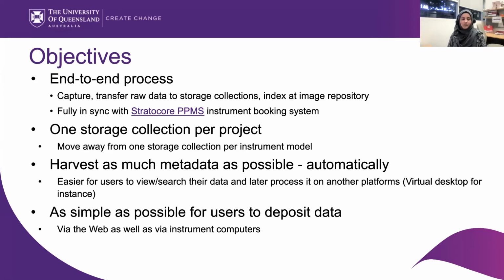So we dealt with it in two ways. In Pitschi, we are also using a web version of Clowder, so they can just upload using the web browser, and we mount the collection directly to the instruments project-wise, and they can just land their data in there. So these are the main objectives we took care of when we were establishing this. So, next one.